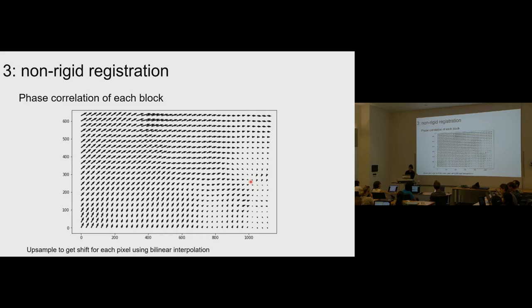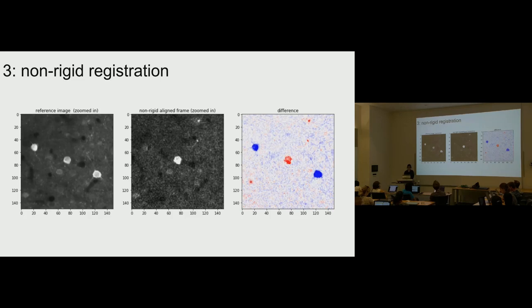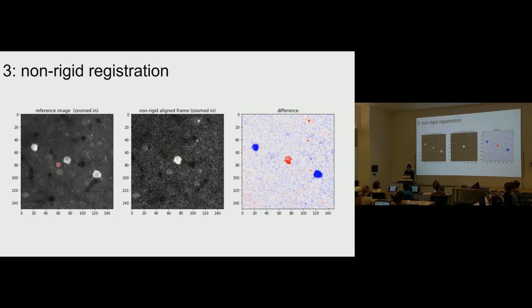After non-rigid registration, this is what the image looks like. We're not seeing any shifts on the cell, which is good — we were hoping the cell wouldn't move after non-rigid registration. It's much easier to see these shifts in the GUI, so we'll look at that later. Next we'll talk about benchmarking.